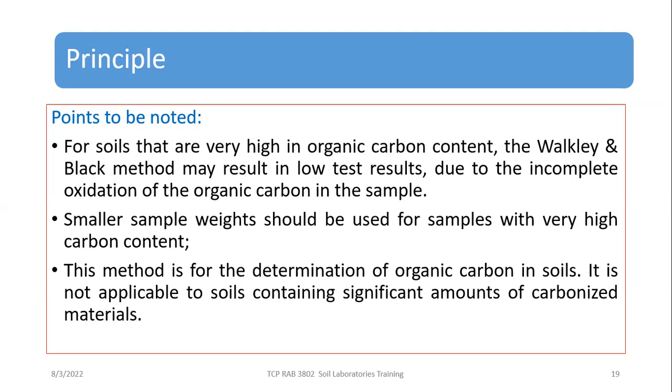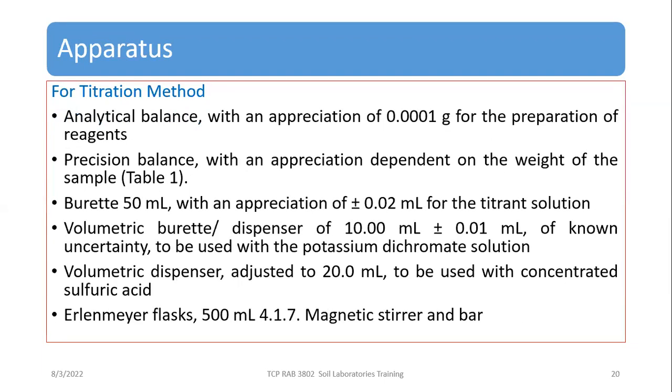Therefore, in such cases, maybe it is better to add HCl at the beginning to get rid of the carbonate form of carbon, leaving the organic carbon.